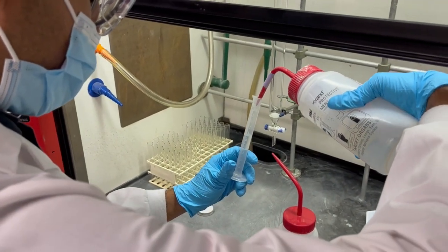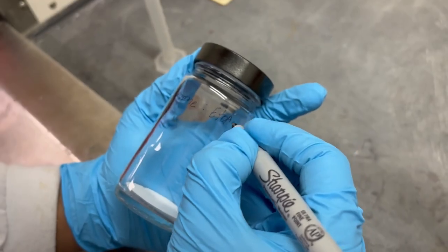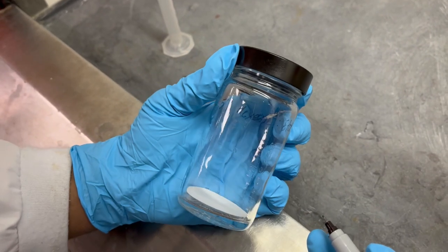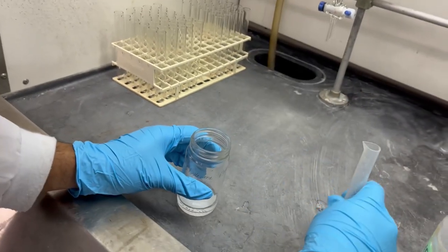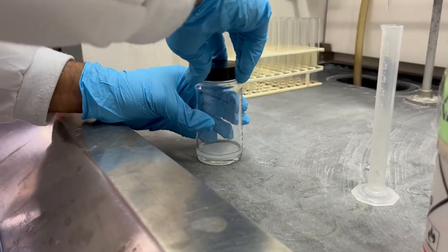Next, a thin layer chromatography or TLC chamber with 5% hexane to ethyl acetate is prepared to develop plates in order to monitor and determine what product is eluding from the column.